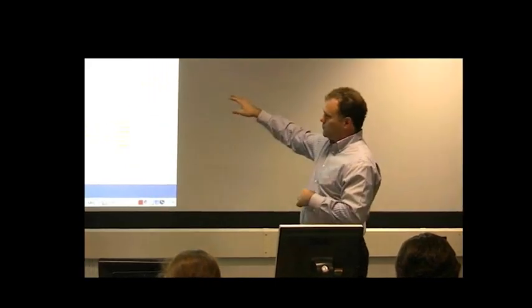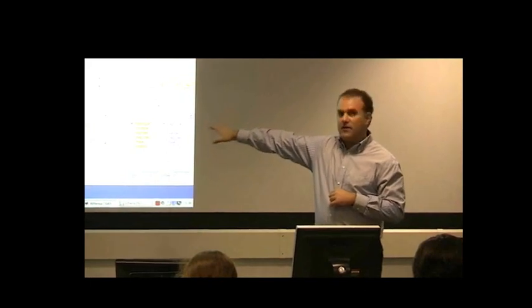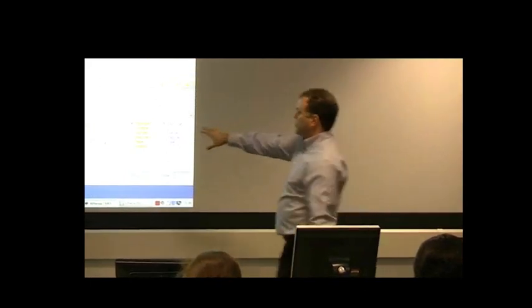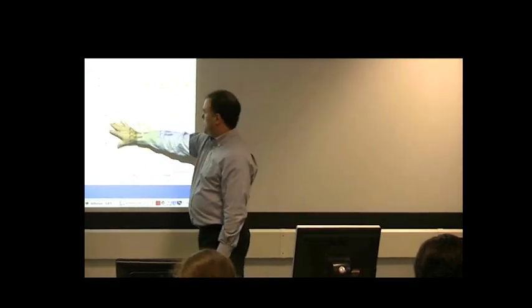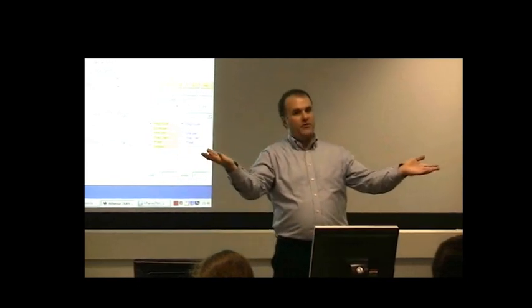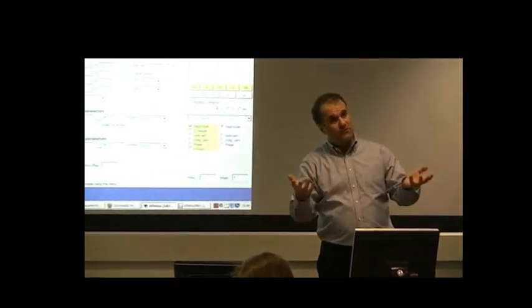When we do Fourier transforms here in Athena, all we're doing is visualizing the data, right? These two sections of the screen just say how it's going to be displayed in the plot window. They're not really processing parameters per se.